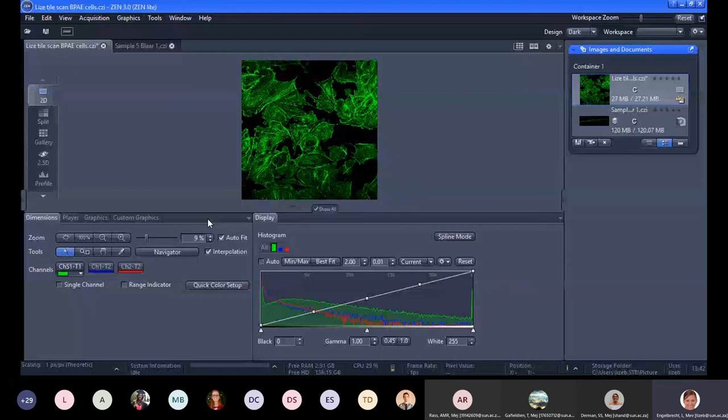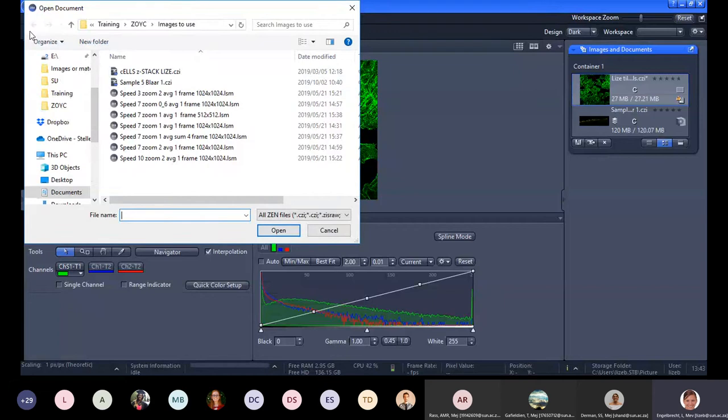I can try and slide this one on this side. It's not taking away the oversaturation. So you need to be very, very careful of oversaturation at the time of imaging. It doesn't help afterwards. We can do nothing with the image that's already oversaturated. Right. Now, another point here on this scale is the gamma level. I want to show this actually in a different image because I have images that display this a bit better. Let's go see this one.